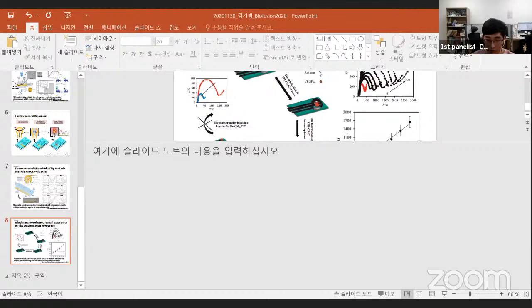When you are dealing with small volumes in microfluidic devices, you have to induce flows, but the flows can sometimes be very complex, and even non-experts do not know how to induce such complex kinds of flow. This is one of the bottlenecks for commercialization. Okay. Basically the flow itself. Okay.